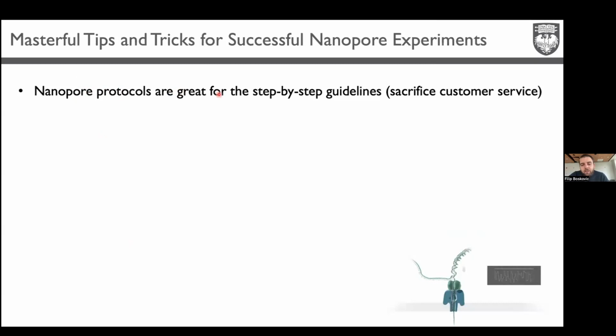I really recommend, before you even start, just try to see how your experiment would look. And if you don't feel comfortable, you can always talk with people around and say, oh, does this make sense? It sounds too simple. And they have really step-by-step guidelines, so you can track each step, how long it takes, and so on.